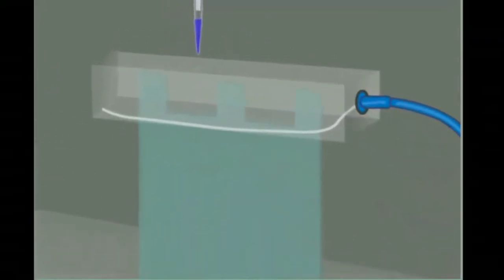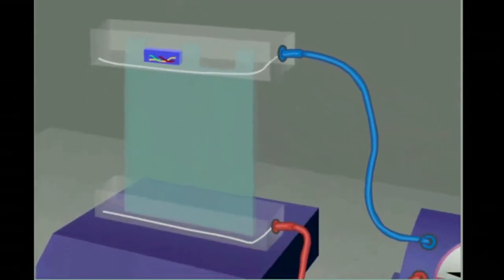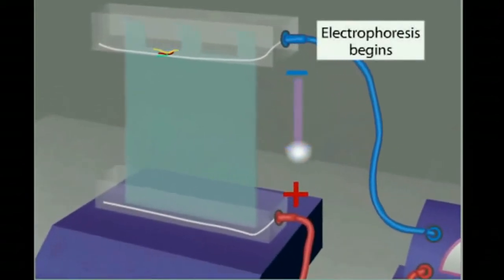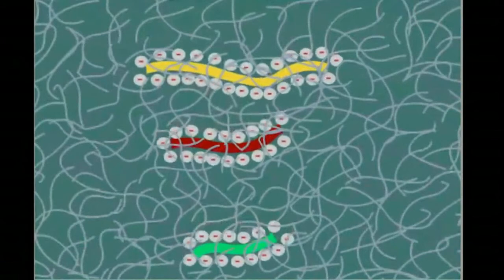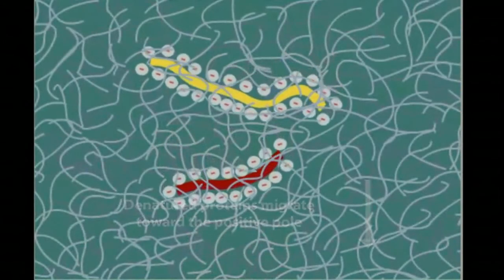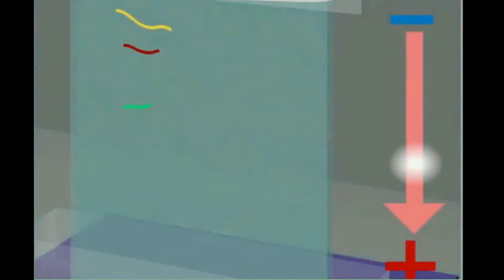At the end of the incubation period, the fragments are separated by length from longest to shortest, and this is done by the electrophoresis process. DNA molecules are set upon a polyacrylamide gel, where an electric field is applied on it, and induces the nucleic acids to migrate toward the anode, due to the net negative charge of the sugar phosphate backbone of the nucleic acid chain.